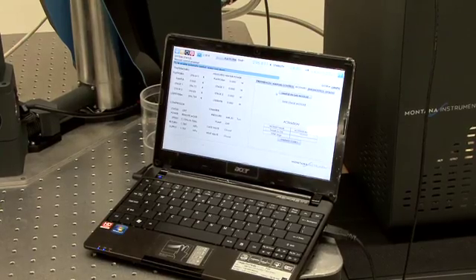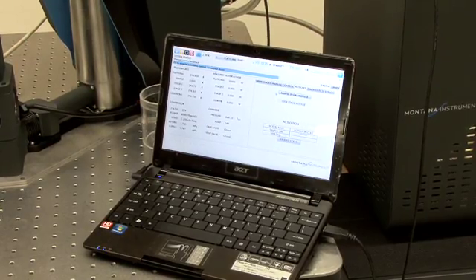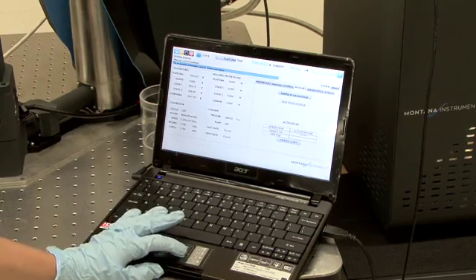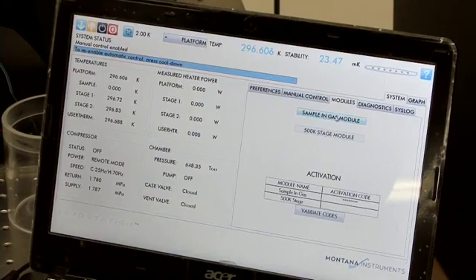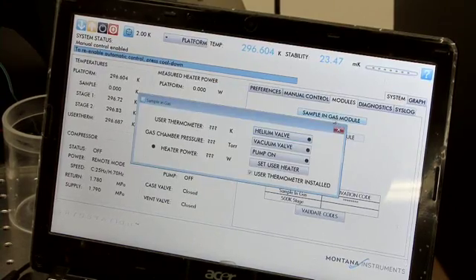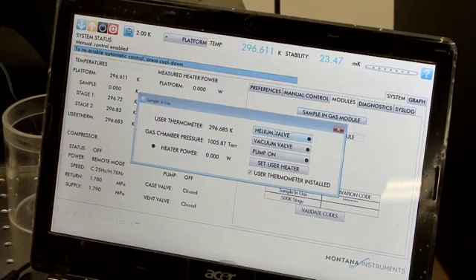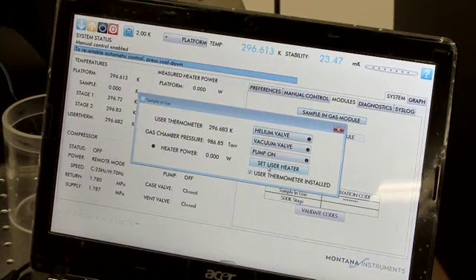The sample and gas module can be controlled with the user interface under the system tab and then go to modules. Then simply select sample and gas module and the panel that comes up can be used to control everything with the sample and gas.